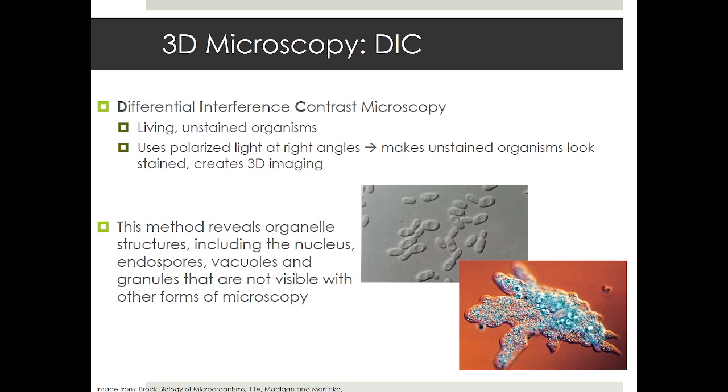Now, we don't always like to look at flat cells because what's the fun in that? Sometimes we like to see things in a more three-dimensional structure, and this is important, especially when we're looking at larger cells that have a large shape or an amorphousness to them, so that we can actually look at them in a three-dimensional plane. Because if you've ever looked, for example, at cells like amoeba that are enormous, you can never see the whole thing at the same time.